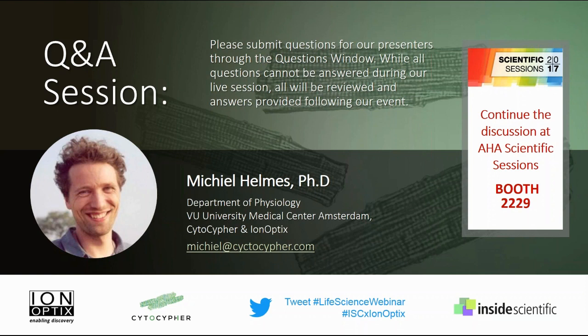And the last thing is, there's a reason why medicine studies are done double-blind, because no matter how hard you try, if you know what you want the outcome to be, you're biased. But if you fully automate the analysis, there won't be a bias anymore because you can't cherry pick your data. So I think that is a contribution, where it just does it and you just accept the rejection criteria that are set. Those are good points.